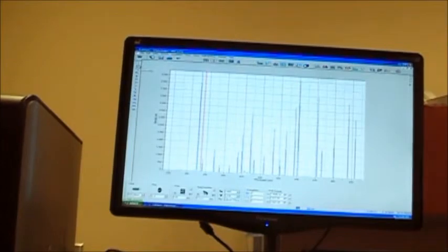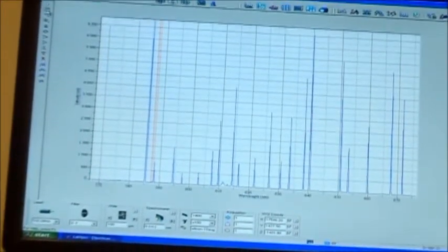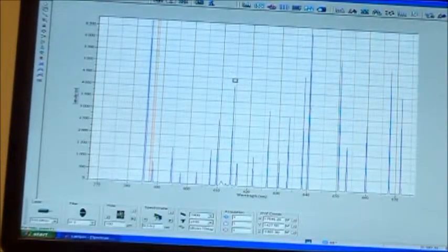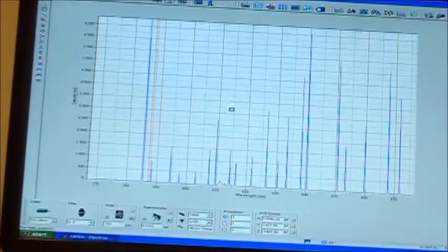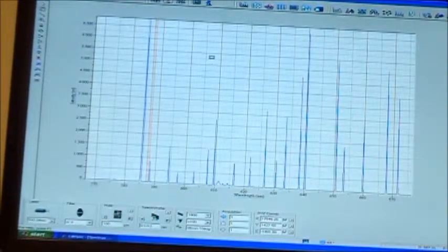The next one down is called a spike removal tool, or it is also called a shape corrector. It is a click, drag, and hold. So if you find a peak that should not be there because it is a cosmic ray or solar spike, you click and hold and then drag this down over your peak and you'll see your peak disappear. And then it's gone.